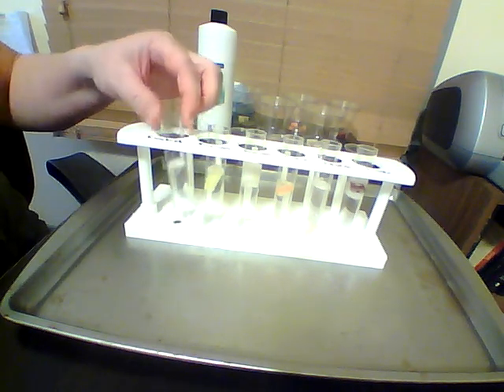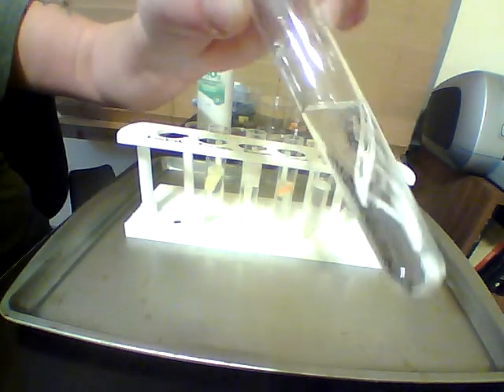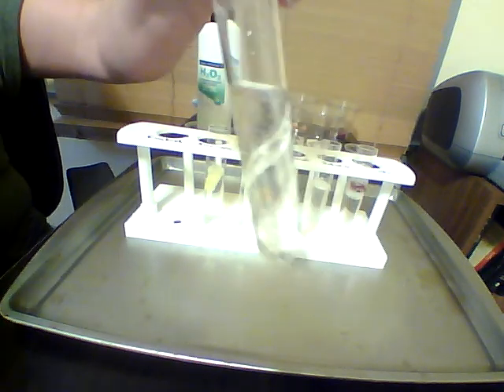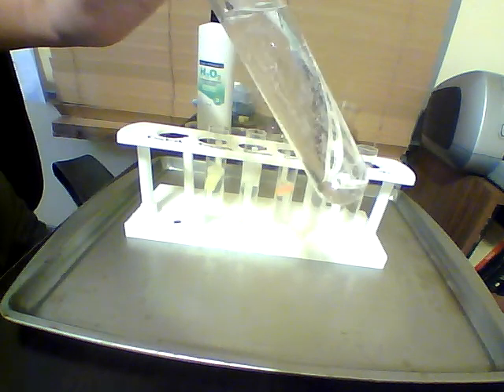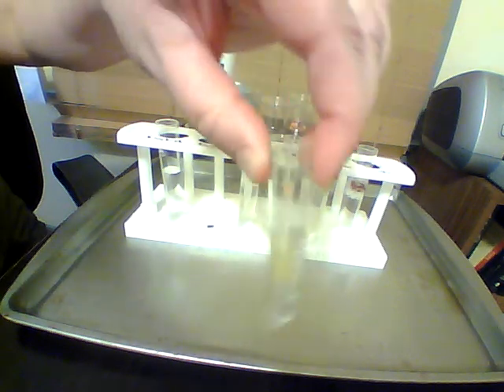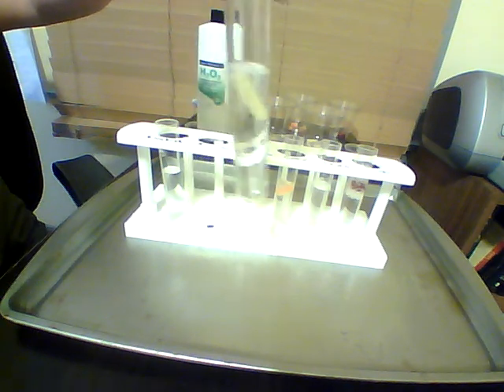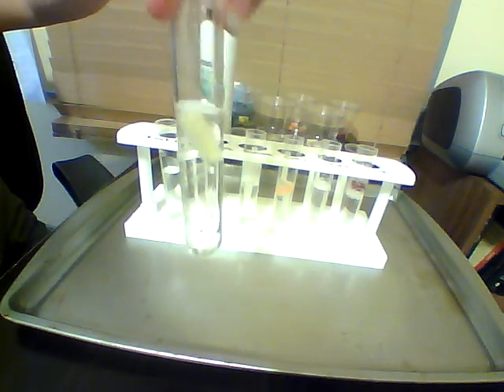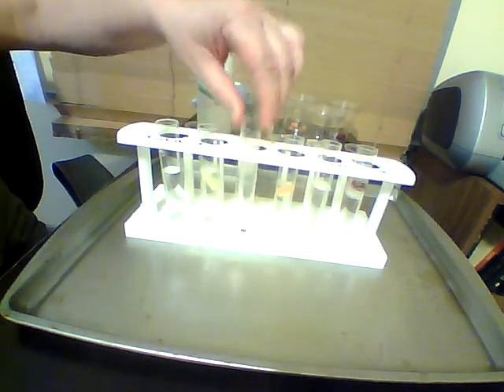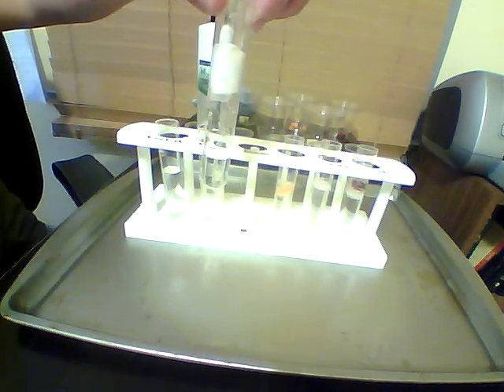So let's take a closer look. Our control doesn't really have a whole lot of bubbles. It has a few because hydrogen peroxide reacts to sunlight, so it will start breaking down when it comes in contact with sunlight. That's why you see a few bubbles in there. So this is our pineapple, and you can see that it's got a few bubbles on the side, just like the control, but it's starting to form this little layer of bubbles on top.